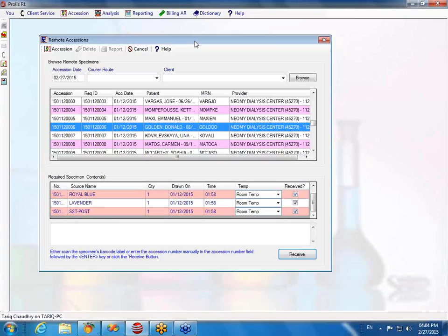I don't know, for some reason you're breaking, Osman. The AutoGenomics platform for DNA testing? DNA testing is a little bit strange, because right now your neighboring lab is doing the same thing. We offered them the interface, but they did not agree to the price we asked, so they are doing it manually. So if you could afford our technology for genomics, we will provide you the interface, otherwise you would have to deal with it manually. What's the price?